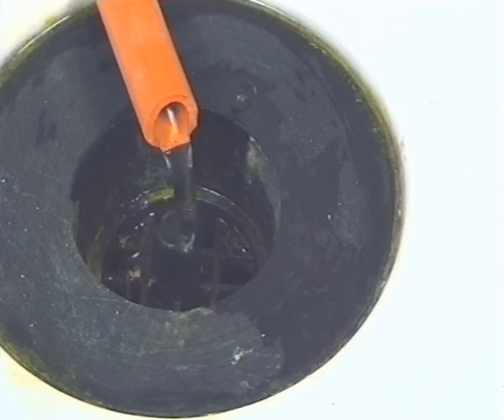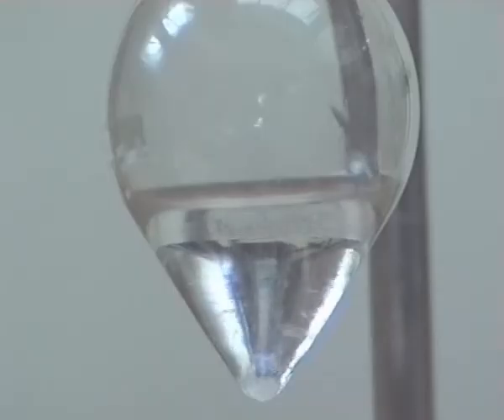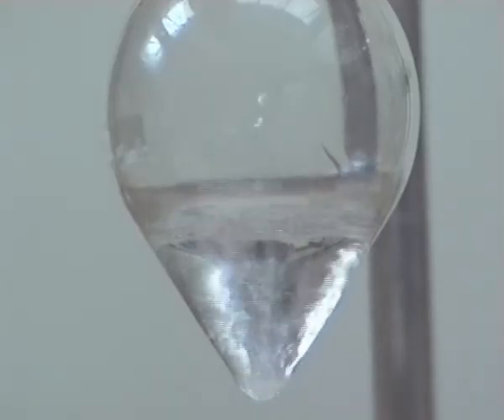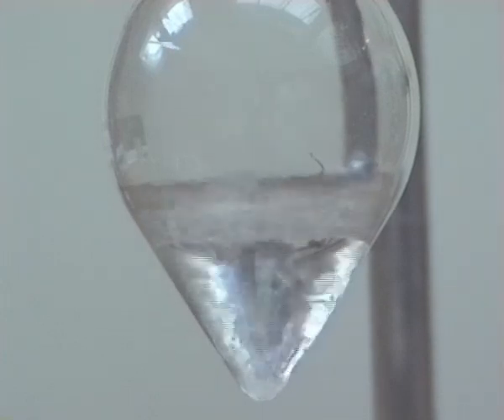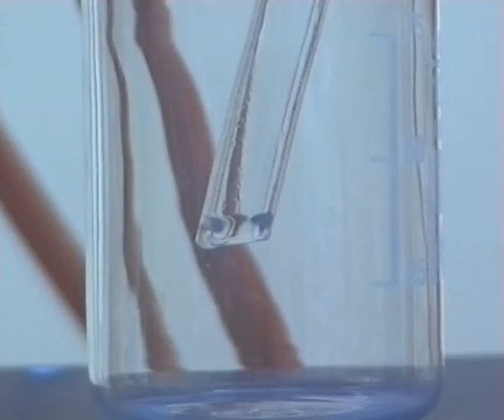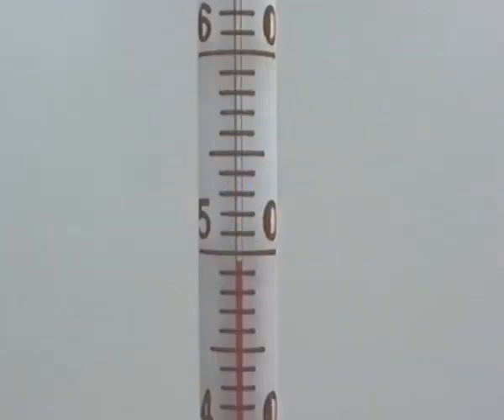A slow flow of cold water entered the Liebig condenser from the bottom. The flask was heated gently and the contents started to boil. The distillate was collected between 50 and 52 degrees centigrade.